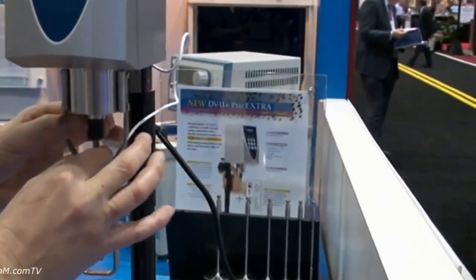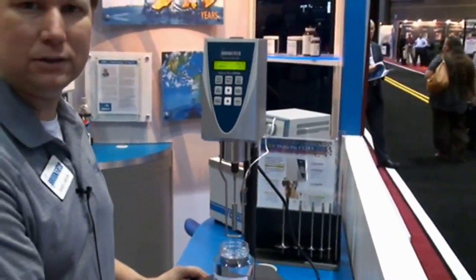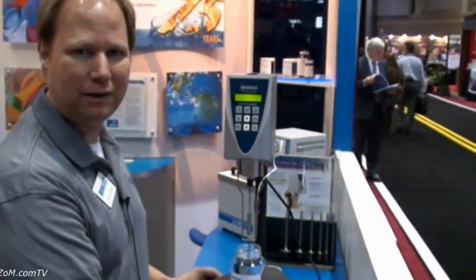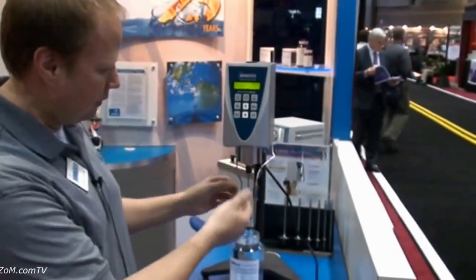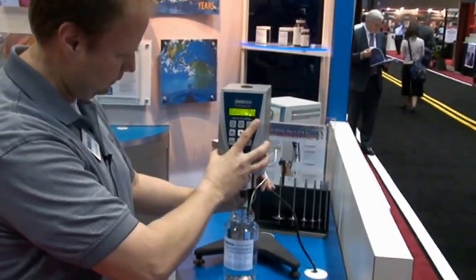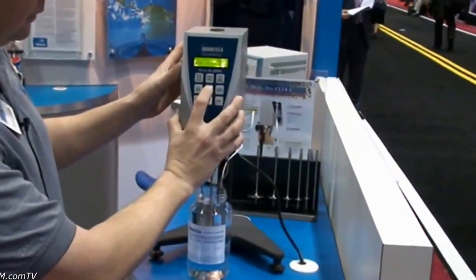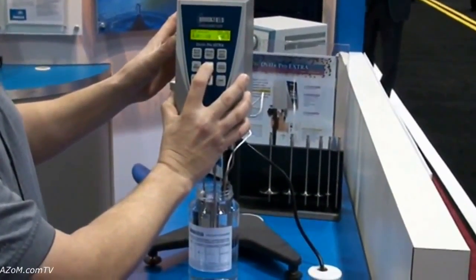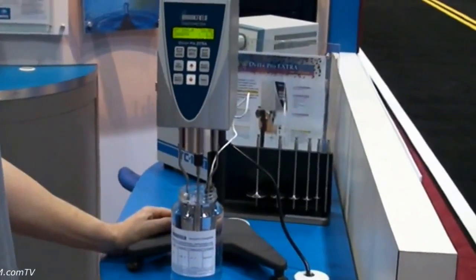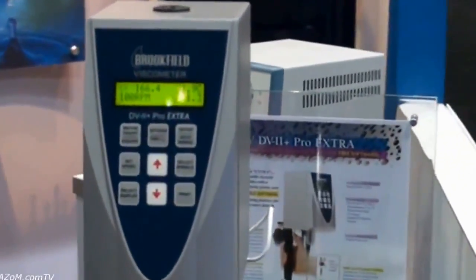I'm just going to quickly take a measurement of viscosity. This unit works on a spring torque basis, so we're measuring the internal friction of the fluid and giving a quick reading of viscosity in centipoise. We have the spindle on and we put it in — you just drop it into the fluid, start the motor at the proper speed, let it go, and it will give you the measurement in viscosity. And that's as simple as that — a 30-second test.